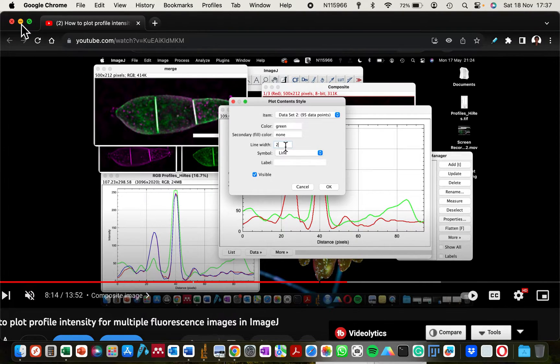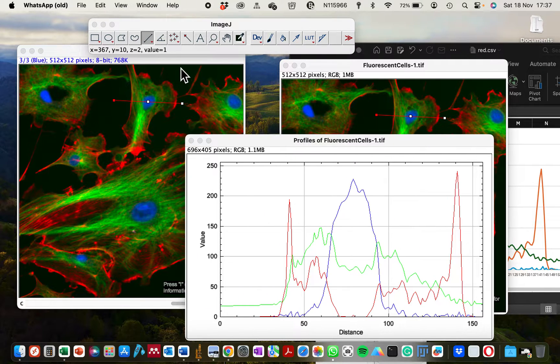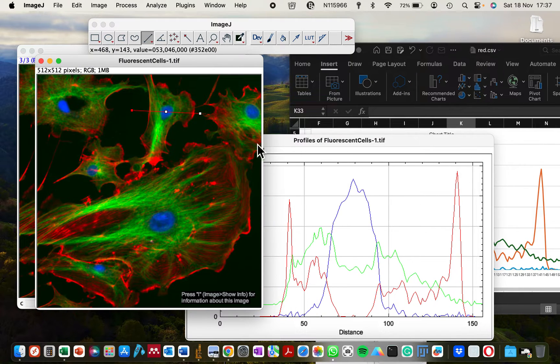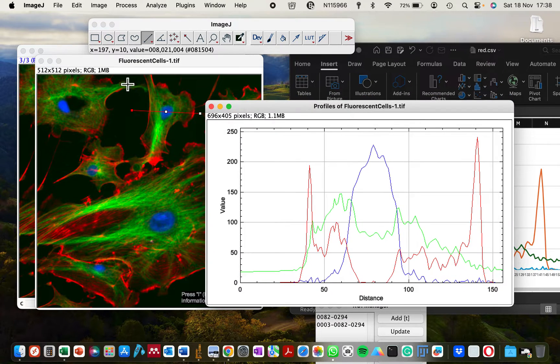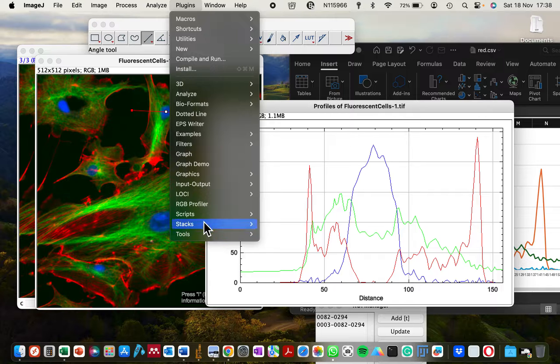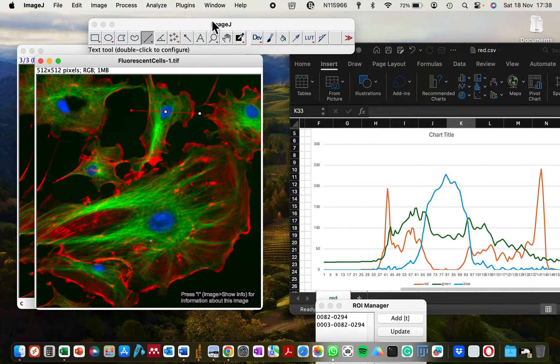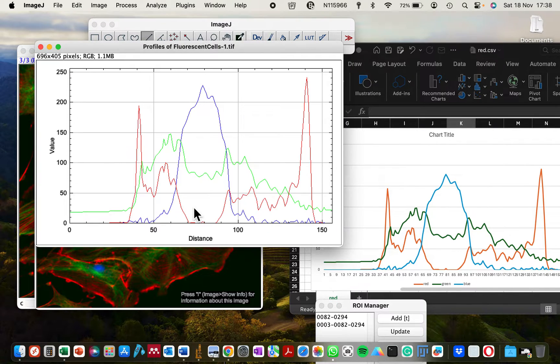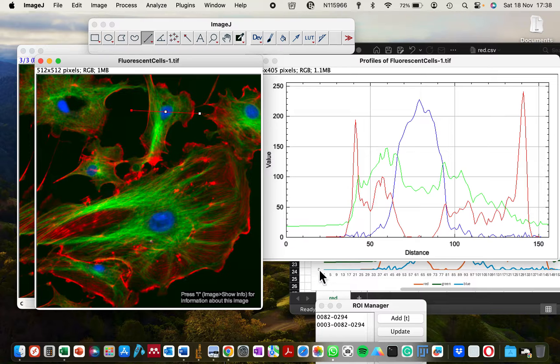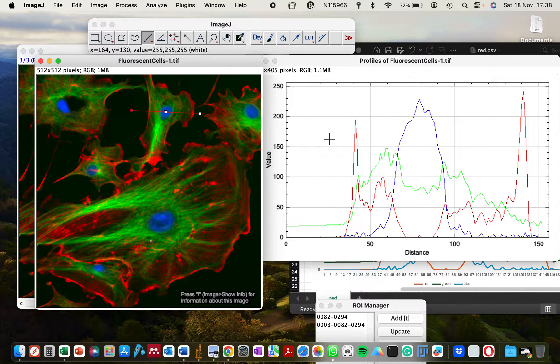Now all you can do is, when you have your image in RGB format after you've merged the channels and generated a line of interest using the line tool, if you go to Plugins and use the RGB Profiler, it will generate the plot for you. However, you can see that the 'Data' and 'More' functions are no longer an option, meaning you have these plots that you can no longer edit to match your presentation or report.